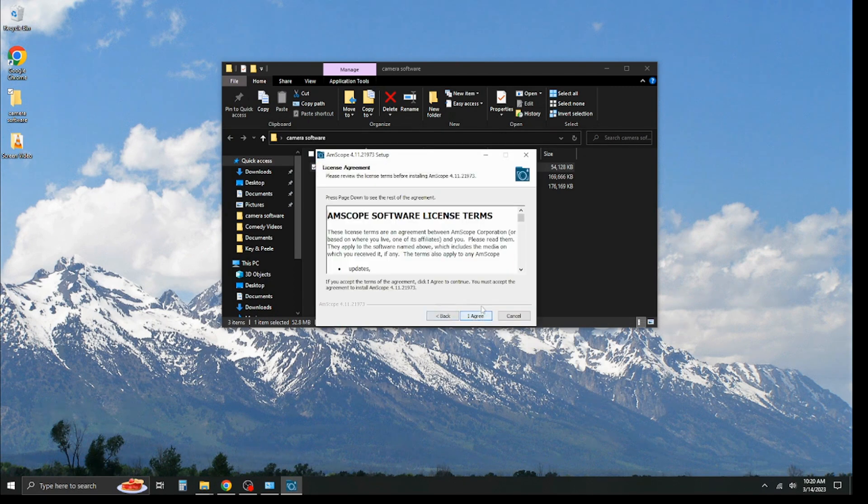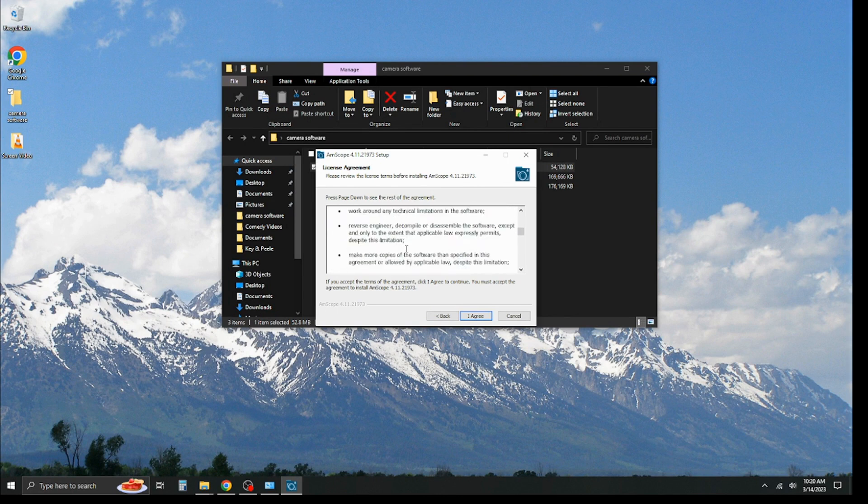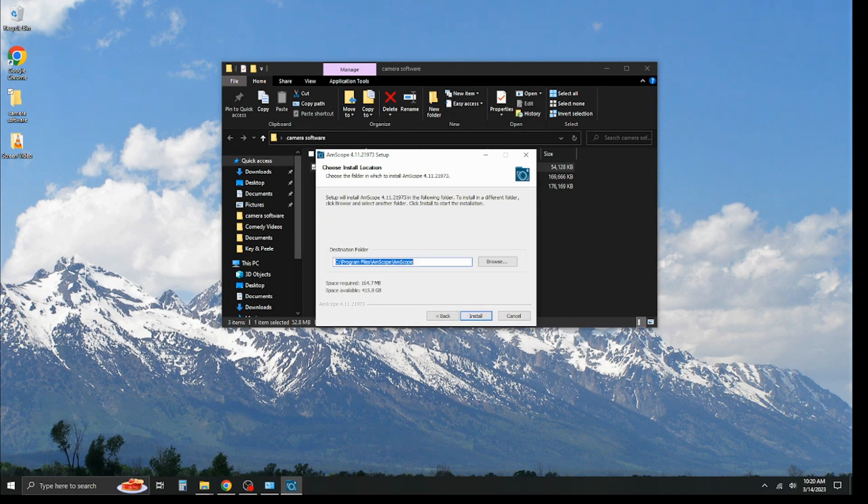You're going to be prompted with this little thing, and you can sit here and read through this if you want. I read through it before, so we're going to go ahead and agree to it. This is where you pick your destination folder. I believe this is the default, and you're going to hit install.